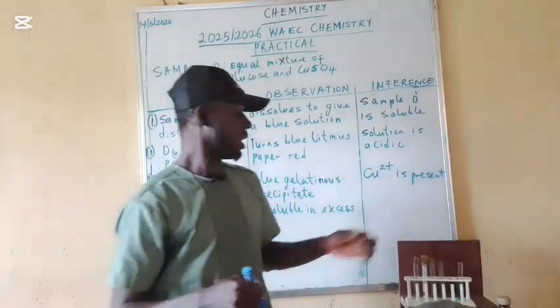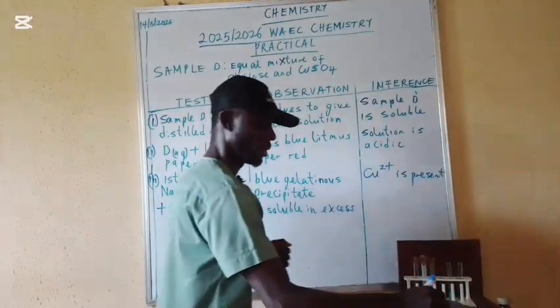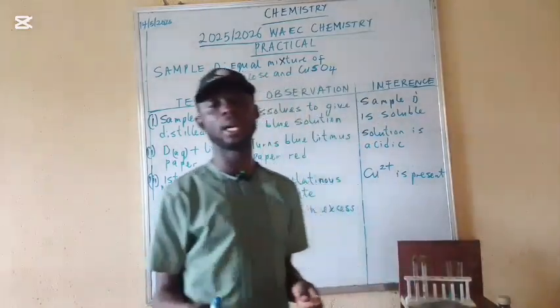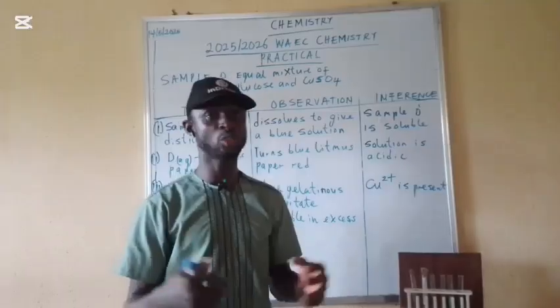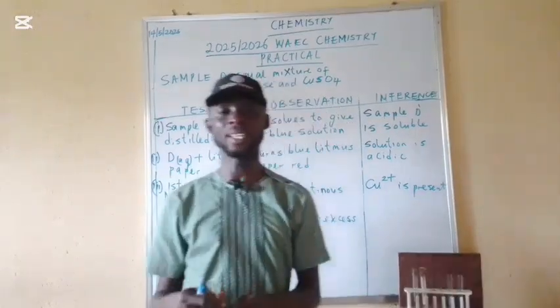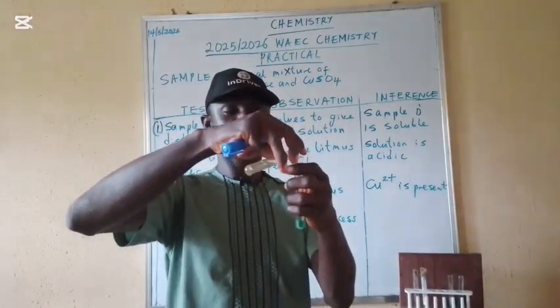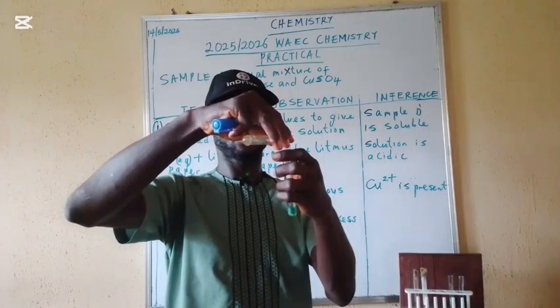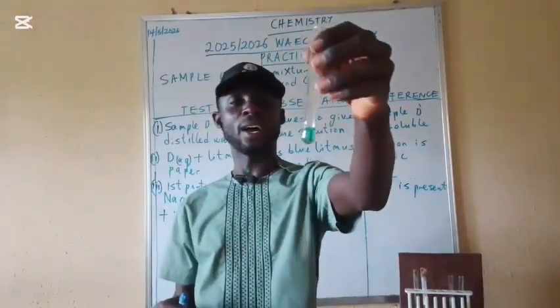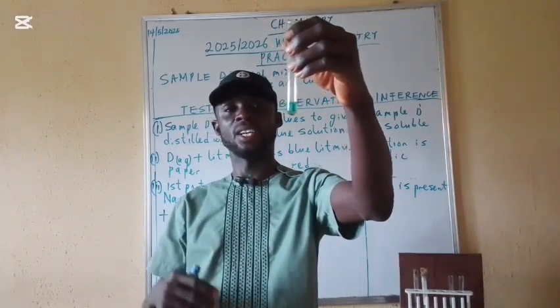Let's test our second portion with ammonia solution. Let's add ammonia to our second portion in drops. From our observation, we have a light blue gelatinous precipitate. So let's now add our ammonia in excess.